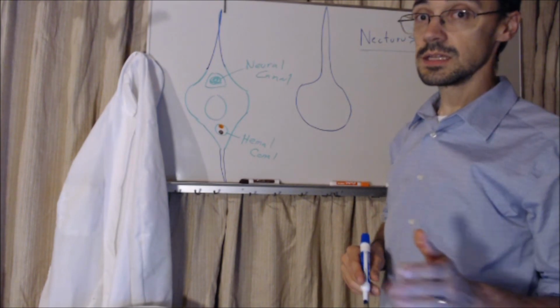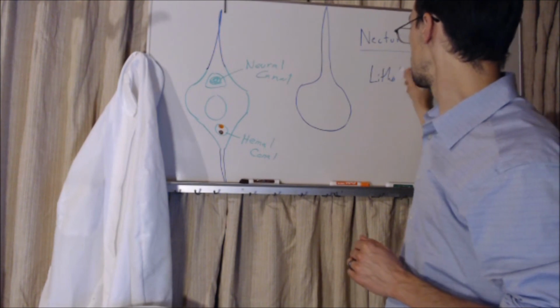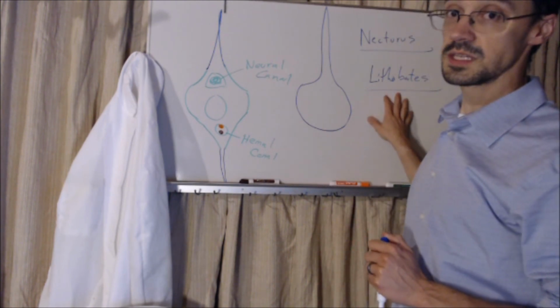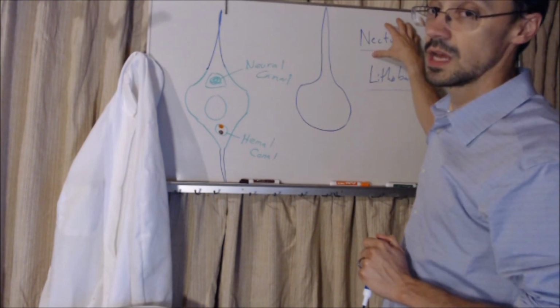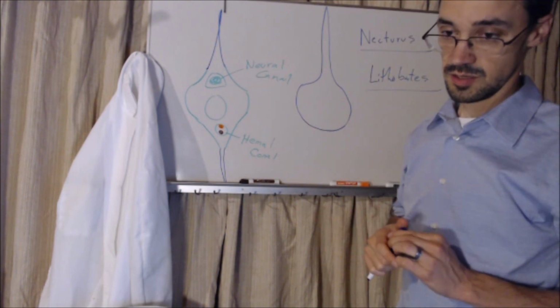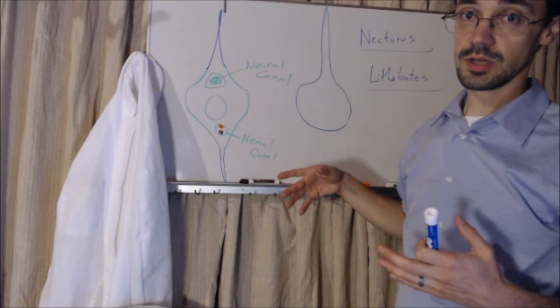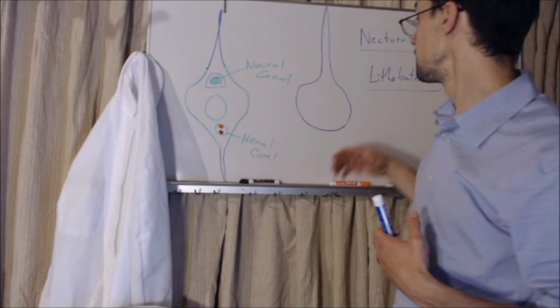The second species that we're going to look at is Lithobates. Lithobates is going to be the frog species that we look at. All right. So these individuals end up in Urodela. These are in Anura. Both are in amphibia. So they're both amphibians. And Lithobates is the one that we're actually going to dissect, and we're going to look more in depth at some of the muscles and the tissues within the body.